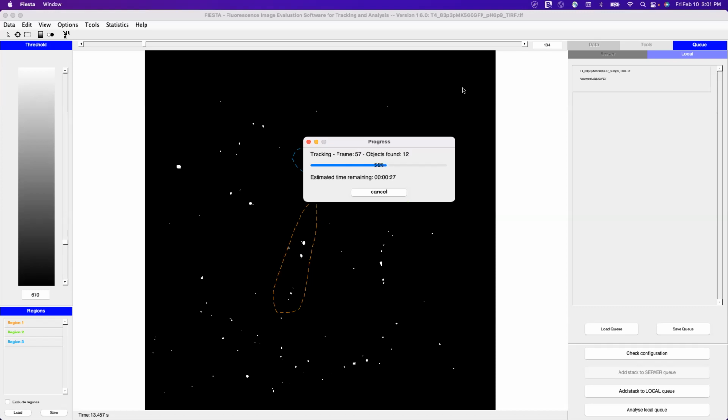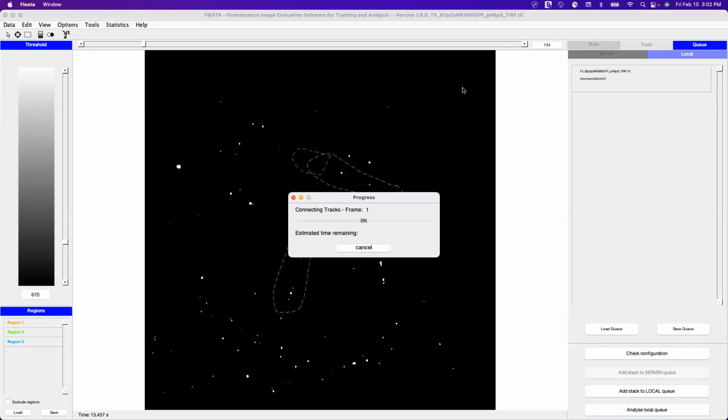Basically the file will give you the frame and then, let's say, a 2D table, and we have X, Y in each frame.